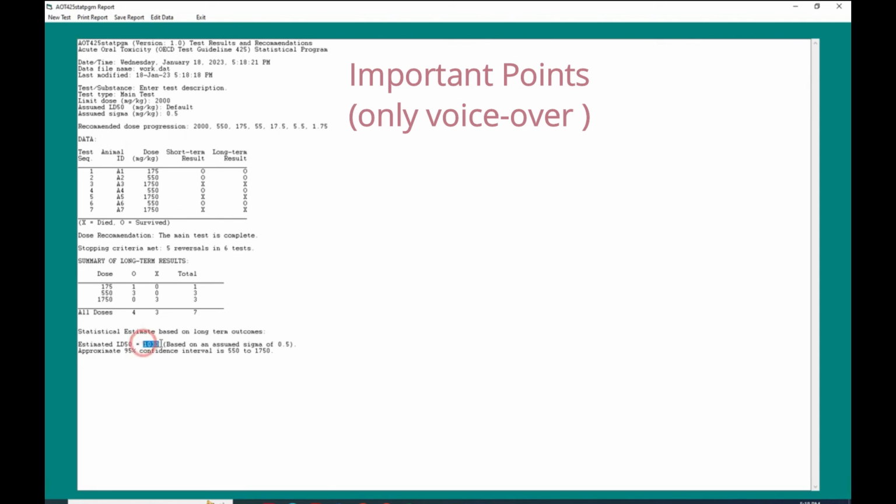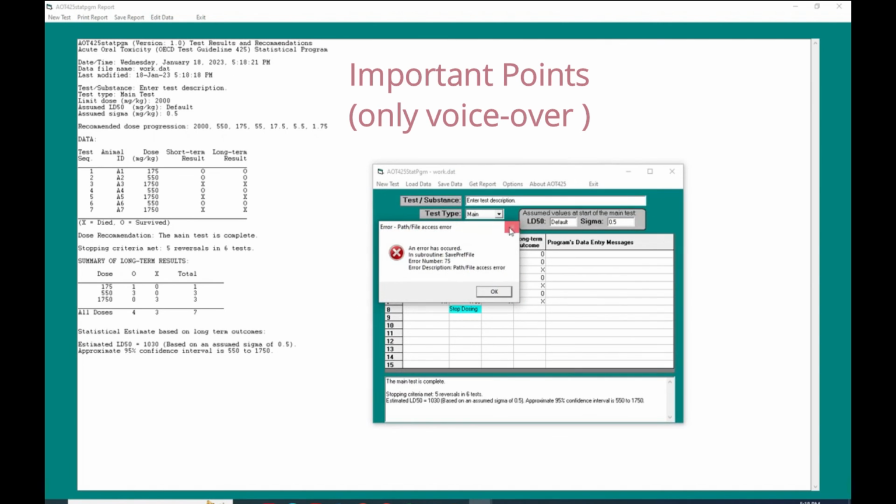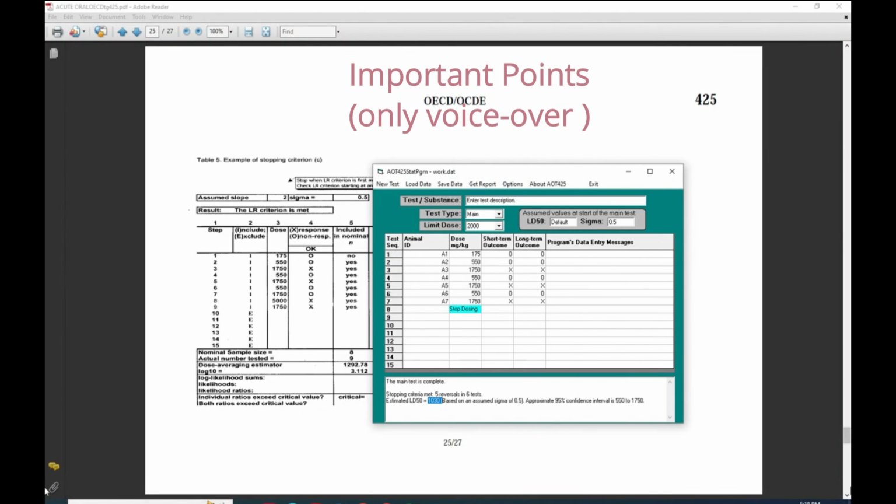In the final point, in the software, the upper bound limit is infinite. More than 20,000 is considered the maximum dose by the software, and the lower bound is 0.0001, meaning 3 zeros after the point is considered as 0. So this is the limit for this software.